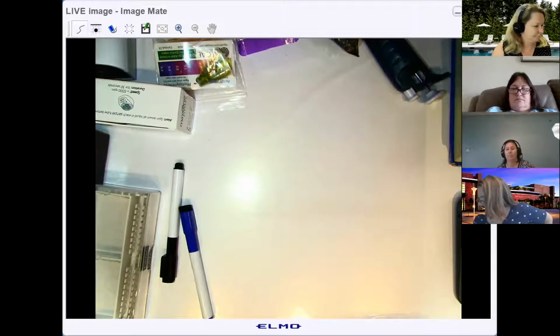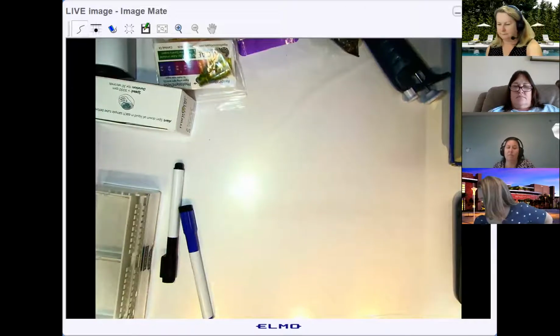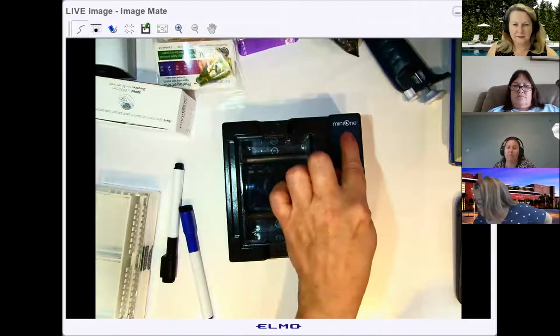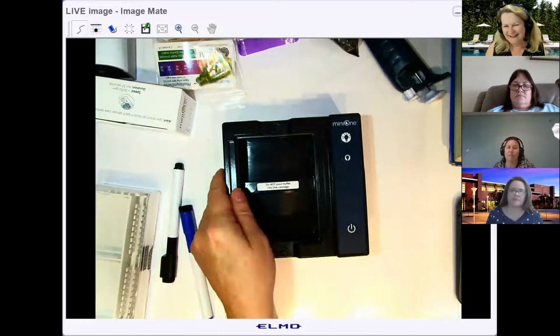You buy their gel electrophoresis kit, it comes with everything, and it's so user friendly, and it's really hard to mess up in the lab. So if you want, I could link that somewhere. Would that happen to be MiniOne? Is that MiniOne? Yeah, that's what we're going to use today. Okay, perfect.